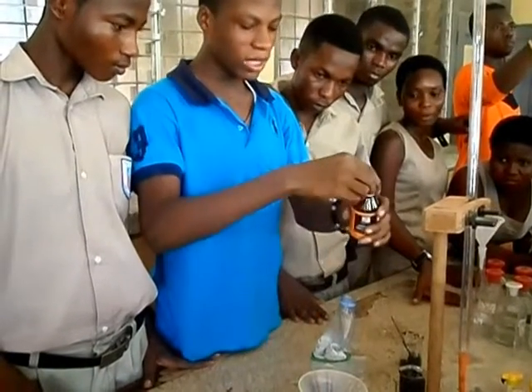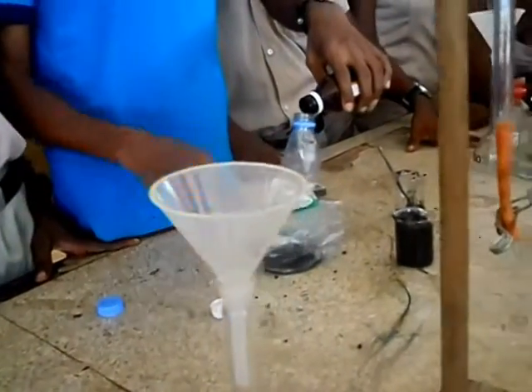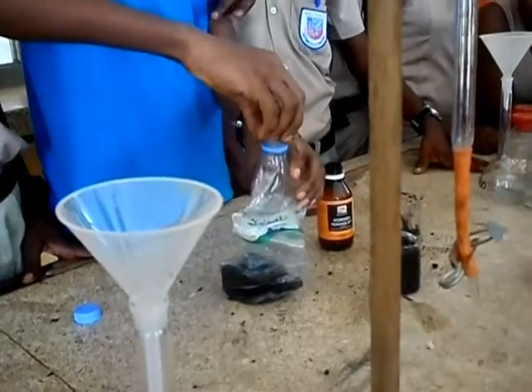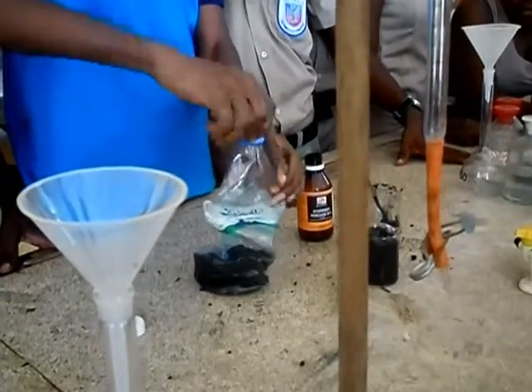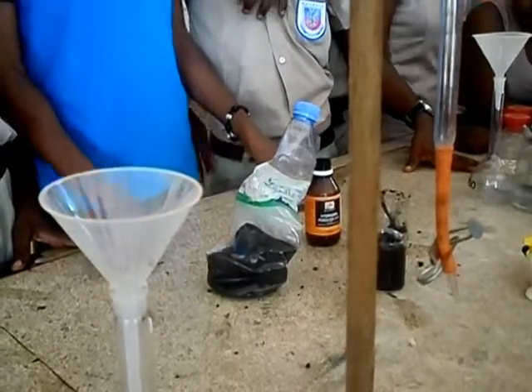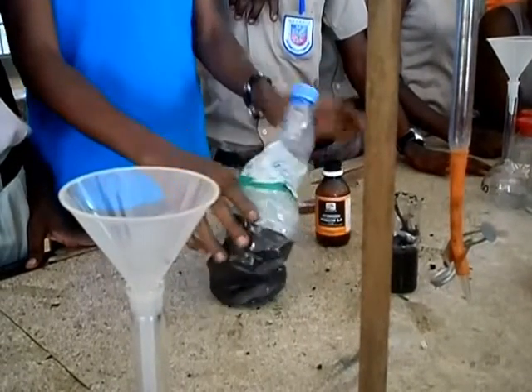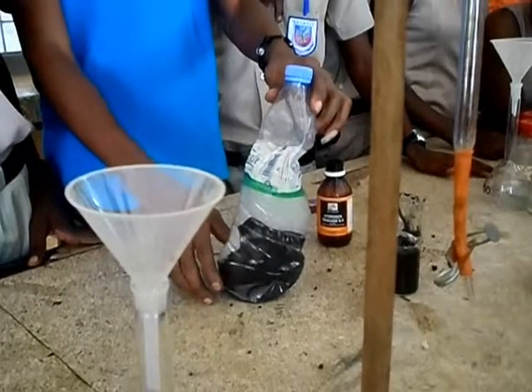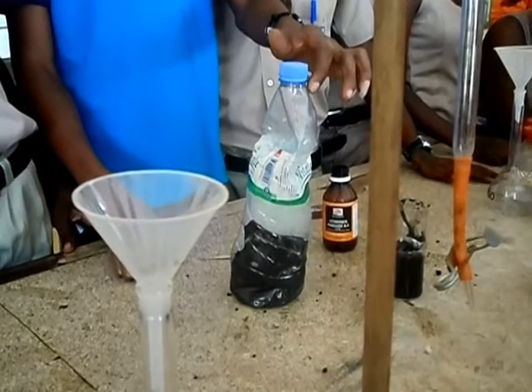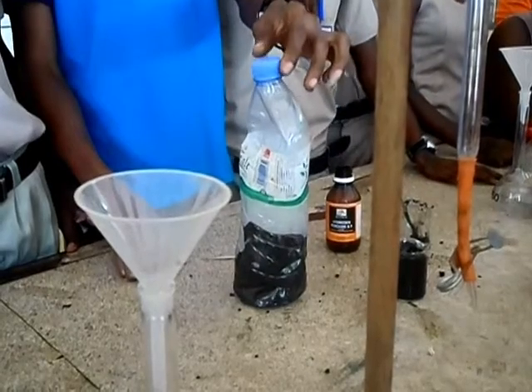It's very clear. Now we are going to pour the hydrogen peroxide into the bottle. This shows that oxygen is present. Now at the surface we are going to add the hydrogen peroxide. The hydrogen peroxide has started to spray.